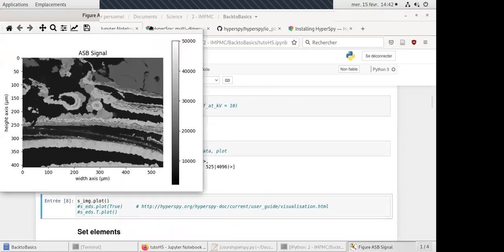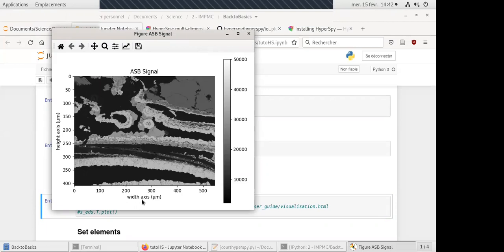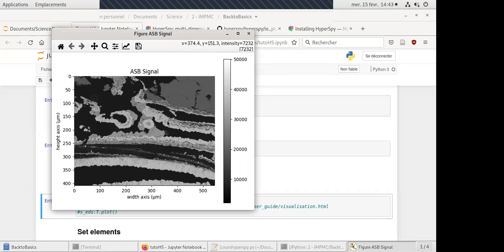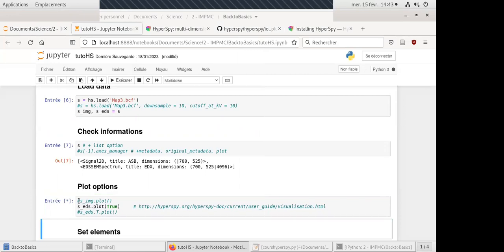When you plot the image object, it writes the data type — it's a BSE signal — and uses the scale to give the dimensions of the object. You can see it's a thin section of what I think was a hydrothermal chimney, and you can see different mineral phases. This is just the image, but we can also check the second object — the hypercube — and when you use the same plot function you get two outputs.